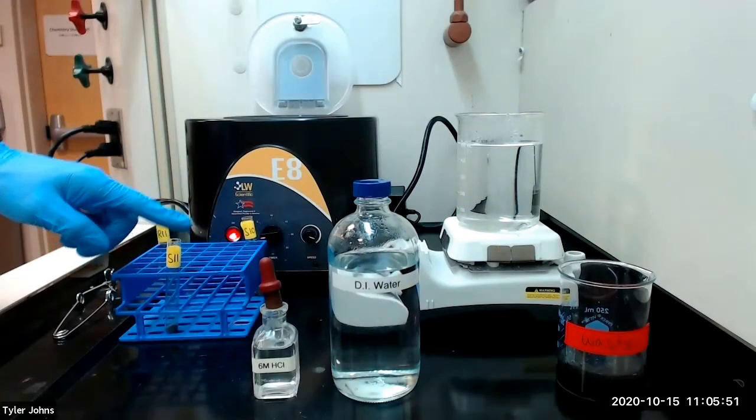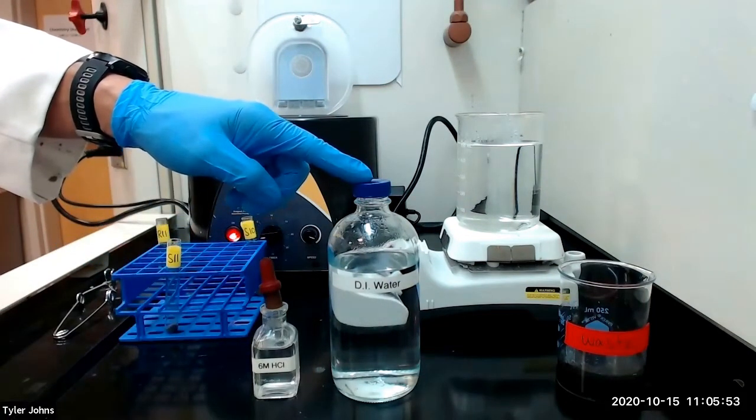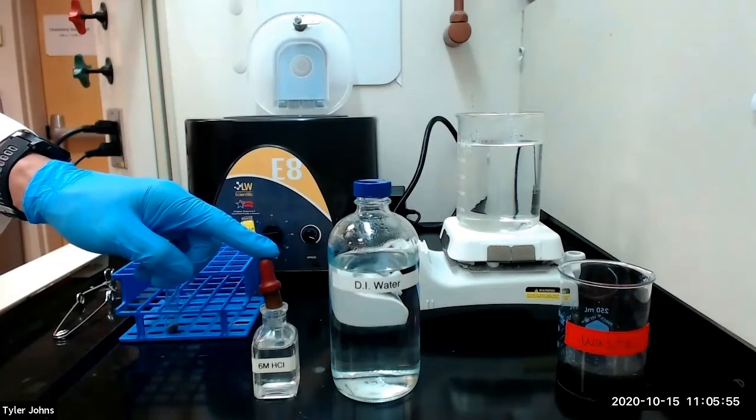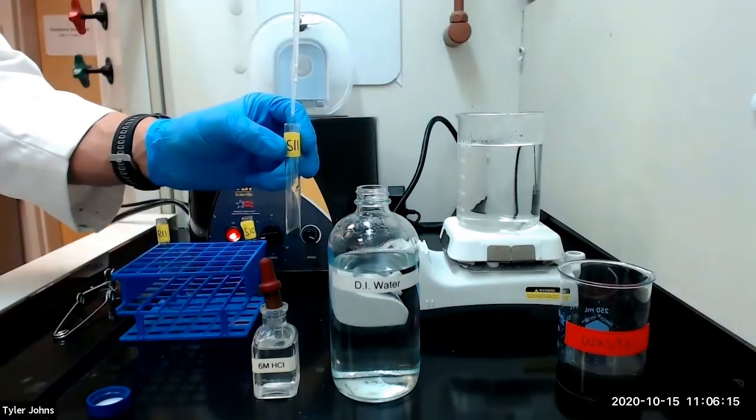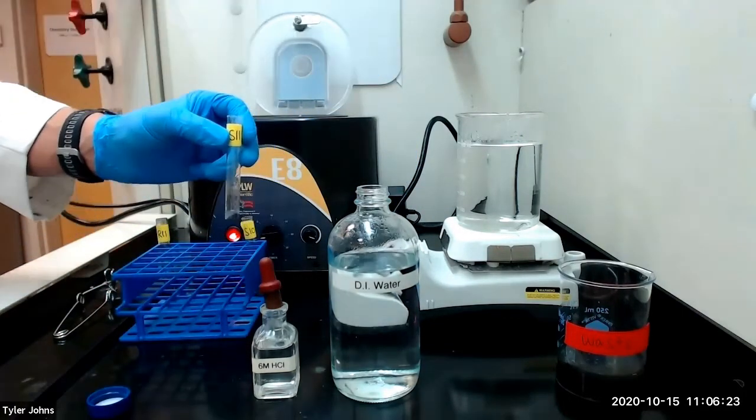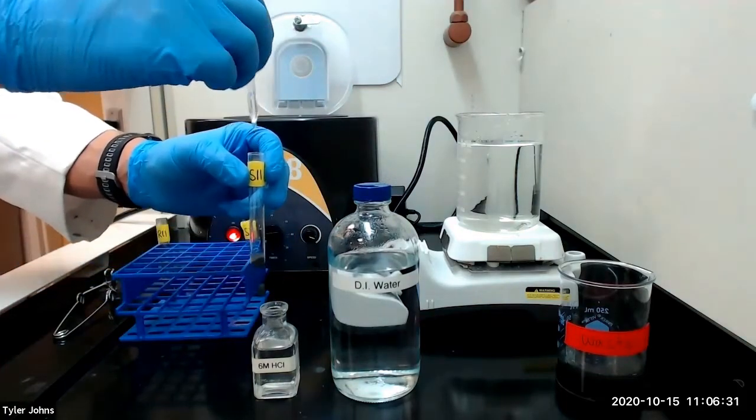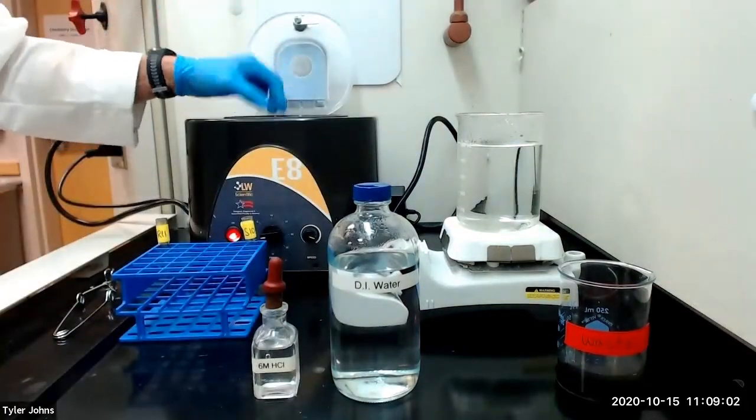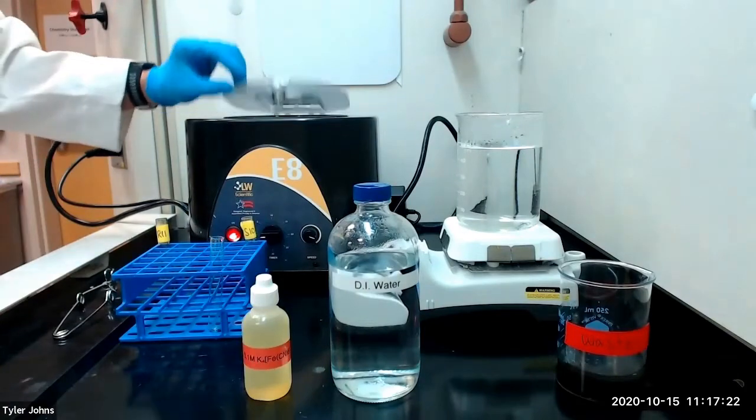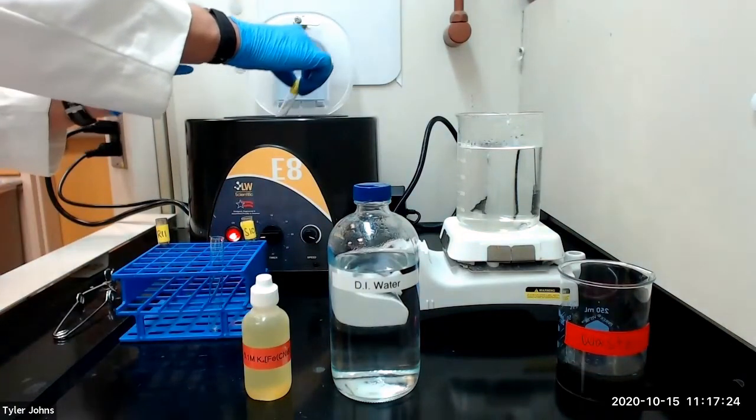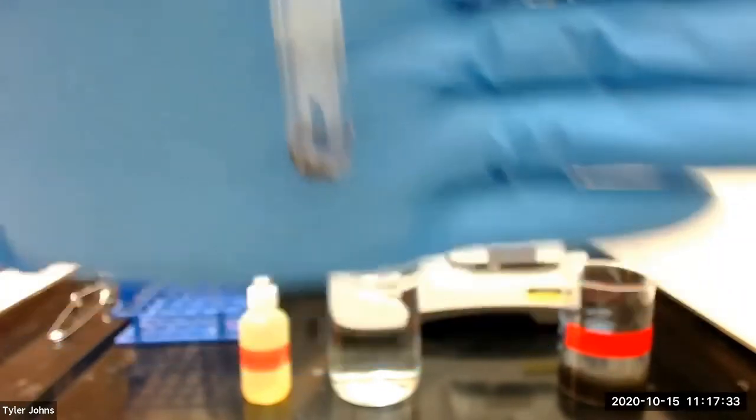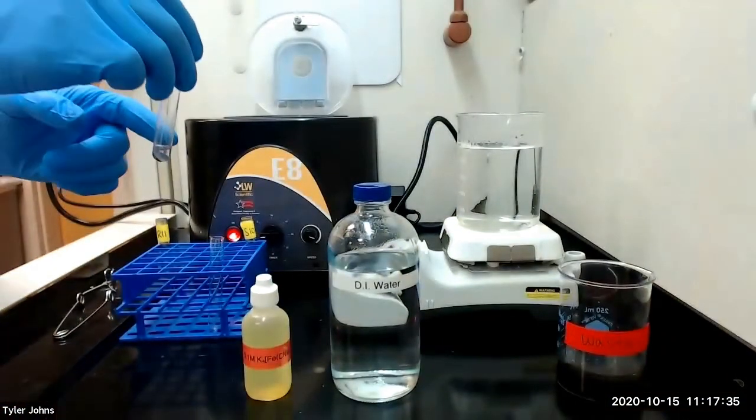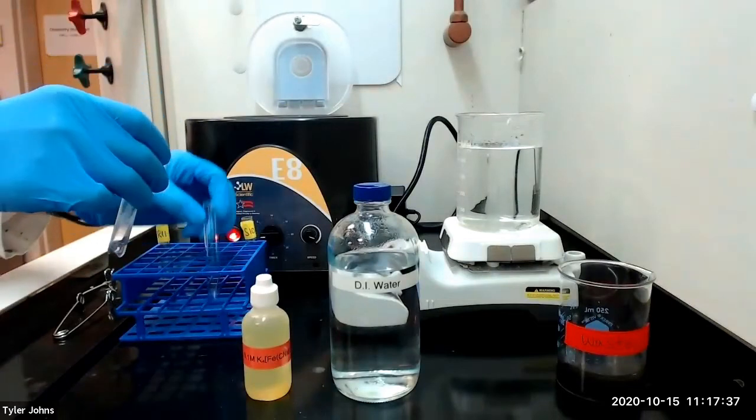To our light gray precipitate, we will add 10 drops of deionized water, and then add 6 molar hydrochloric acid dropwise with stirring until the mixture is just acidic. This is what our mixture looks like after centrifugation. We will then decant the clear solution into a new test tube.